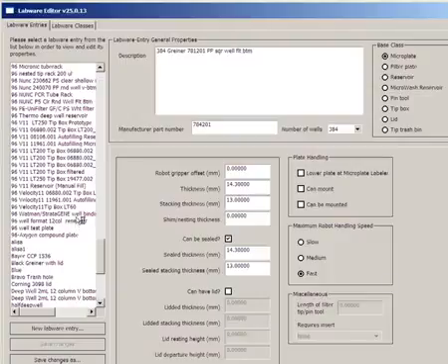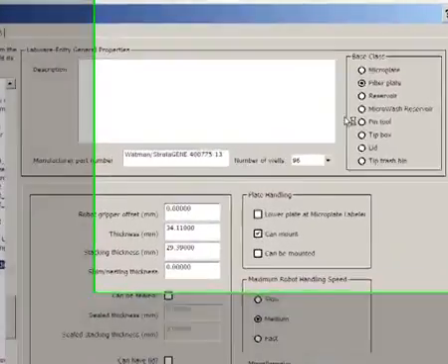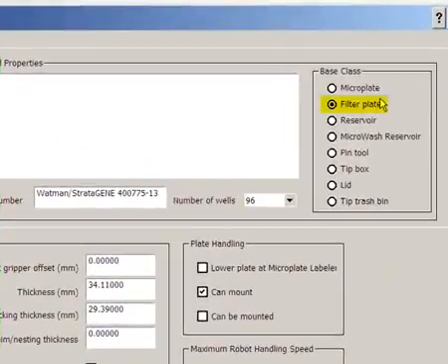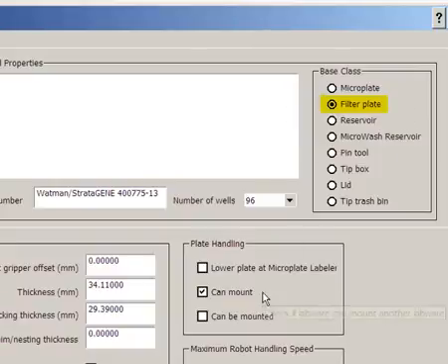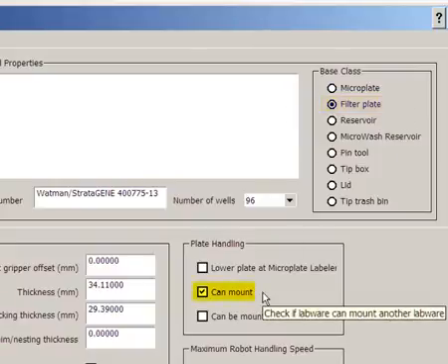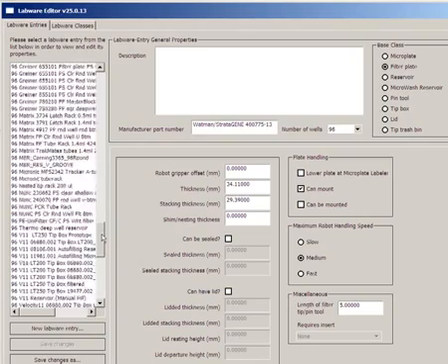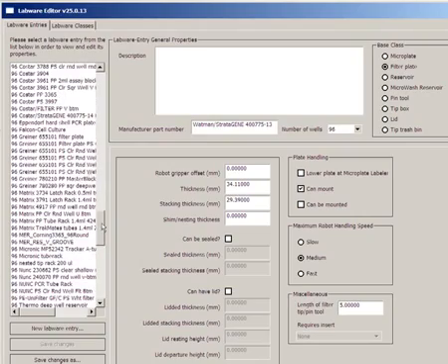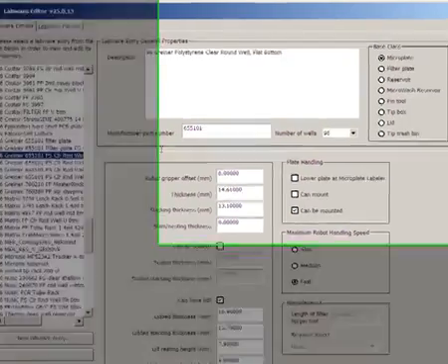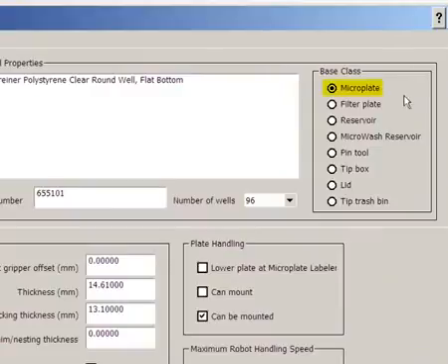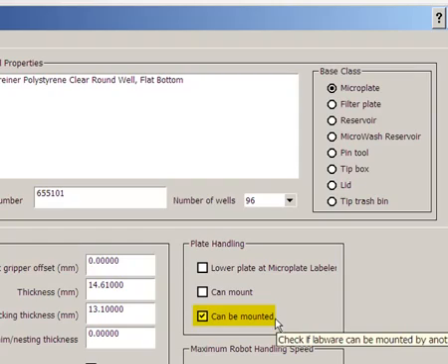I'll select my filter plate. Among other specifications in its definition, I must make sure that it has the Filter Plate base class and it can mount another Labware. For my collection plate, I have to make sure it has a microplate base class and it can be mounted by another Labware, such as my filter plate.